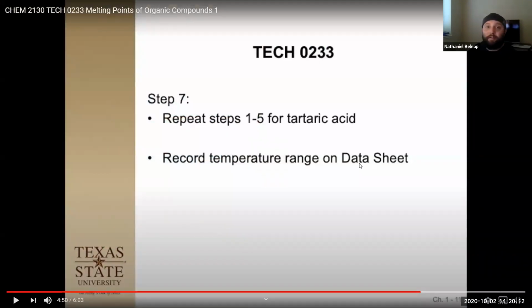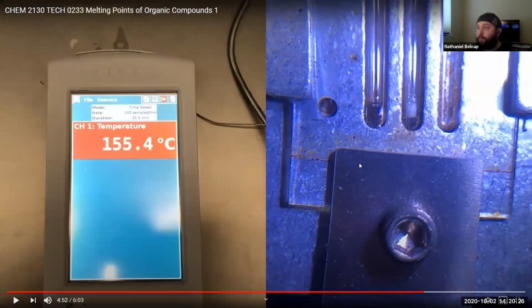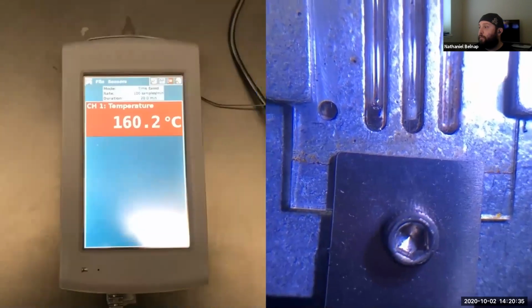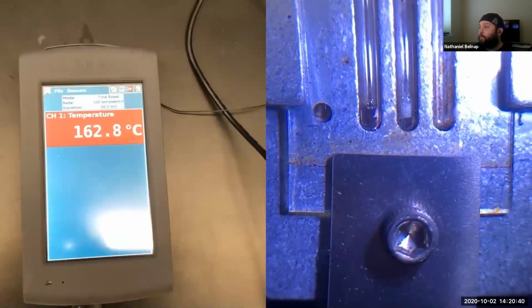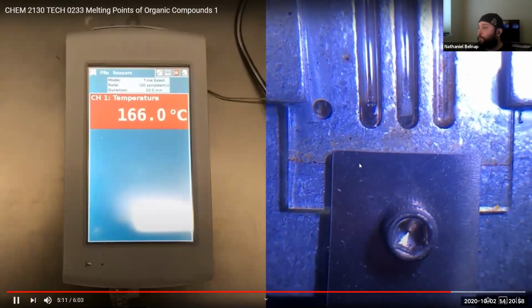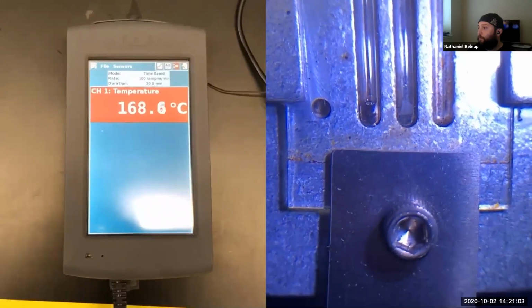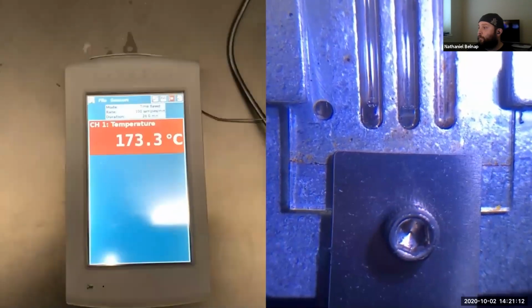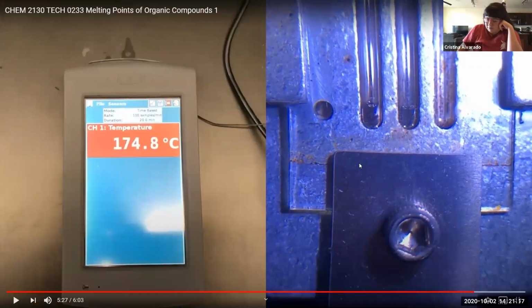So now we're doing tartaric acid. So who's gonna be my third person? Come on. I'll do it. Okay, Christina, okay. So again, the one in the center. Okay. So 164.7. All good. Okay. And now. Okay. 174.8.